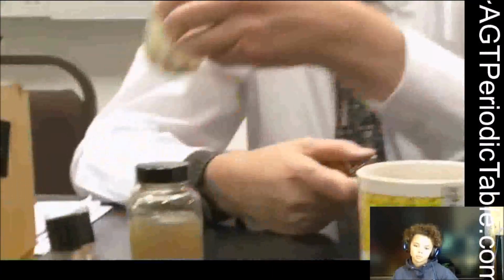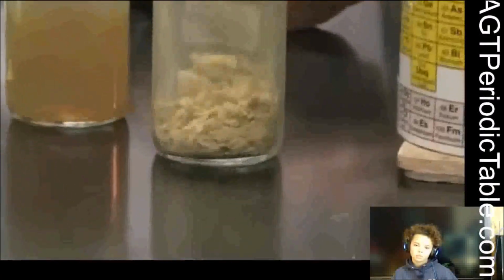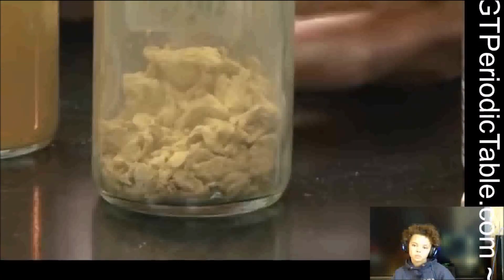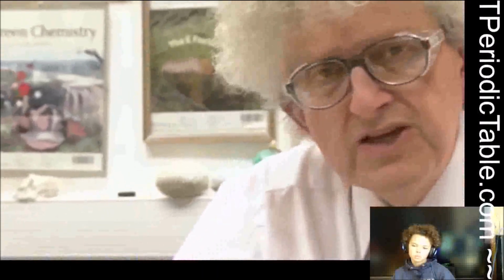People are now using these silver nanoparticles for all sorts of purposes. Here you can see that they've been put onto some sort of plastic, and you can now buy socks which have silver nanoparticles on them, which are claimed to kill the bacteria that make your feet smell. So we're going to repeat the reaction. That's going to come out somewhere, isn't it?